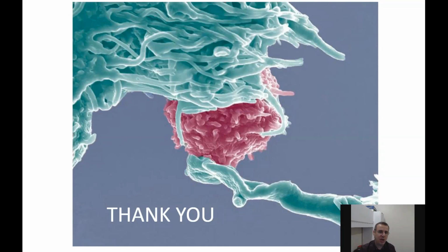But the purpose of our study is to investigate potential proteins using this multiplex panel that other researchers have never even looked at. It's a little bit of a fishing expedition, but I guess it is the only way to really identify a protein biomarker that would not otherwise have been identified. And it is good to see that what we have identified, biologically, it does make sense.